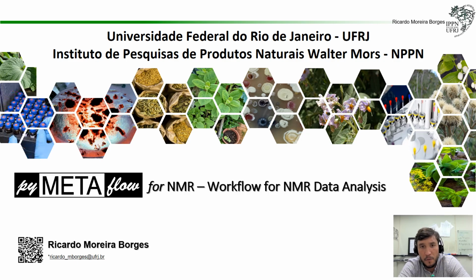This is a presentation for pyMETAflow for NMR, which is a pipeline I created to treat NMR traces for metabolomics and then data comparison. Really, this is a version for NMR. I have a version for HPLC traces as well, and this can be really updated for any kind of trace, for different samples for metabolomics type of work.